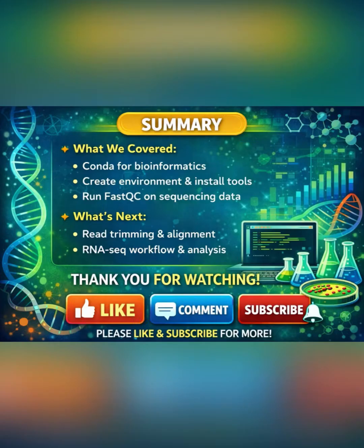Before we end, let's quickly summarize what we learned in this video. We started with understanding conda and why it is important in bioinformatics. Then we installed Miniconda, configured channels, created a new environment, and installed tools like FastQC and HISAT2. After that, we ran FastQC on sequencing data and interpreted the quality report. This workflow is the foundation for most RNA-seq and next-generation sequencing analyses.